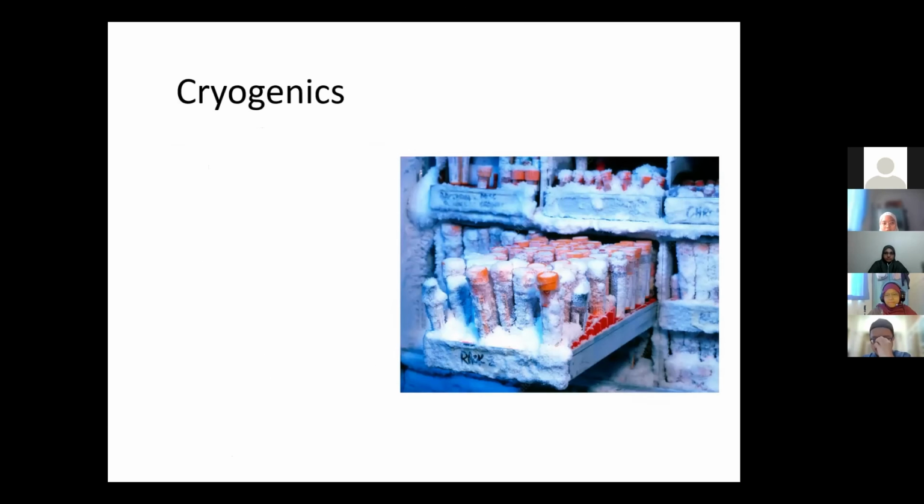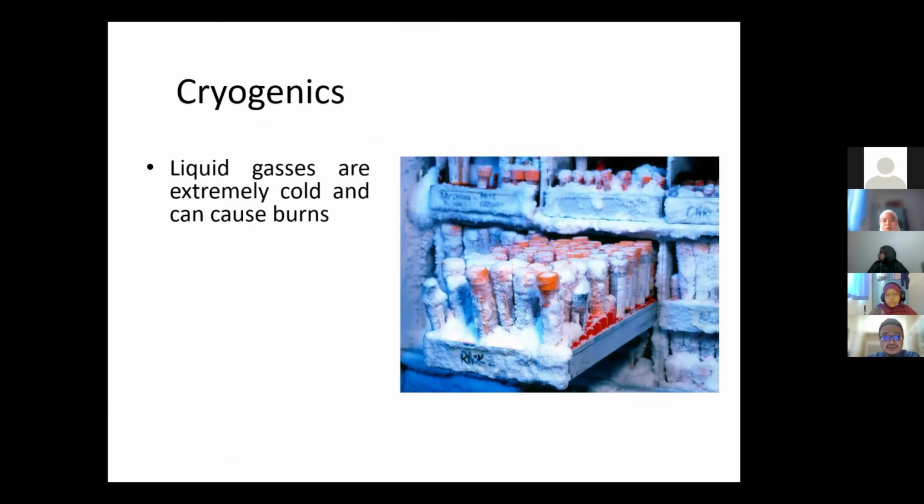Yeah. Cryogenics. Sometimes in the hematology lab, some of the blood samples, we need to put them in cryo tubes, or keep them frozen, yeah, under very low temperature. So liquid gases are extremely cold and can cause burns, and we have to use thick gloves to handle. Yang macam ni, what do you think? What do you think of the picture?